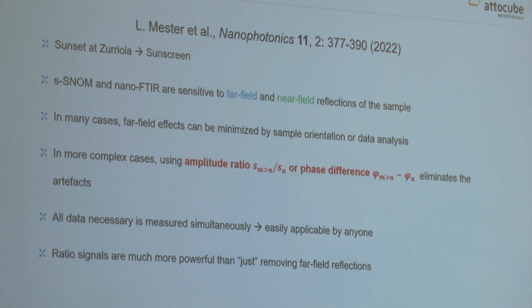The great thing is all this data is measured simultaneously. And even this works on very old data. Maybe in the past you had some data which you couldn't make quite sense out of. Maybe it's worth to just load them in Gwydion, divide them, and see what happens. So it's surprisingly powerful. For being so simple, it's quite powerful to just plot.